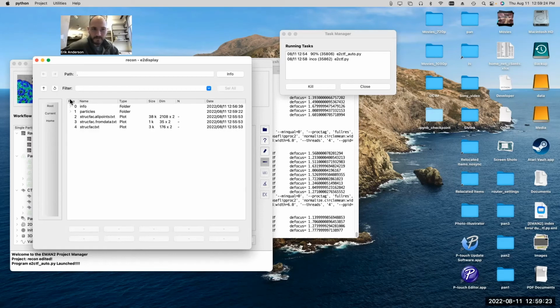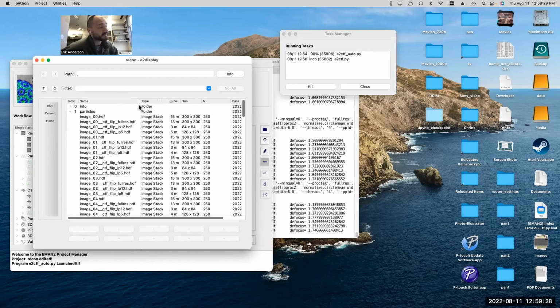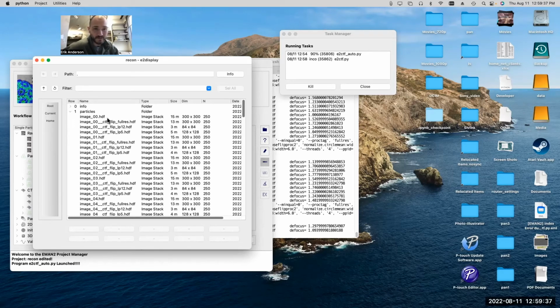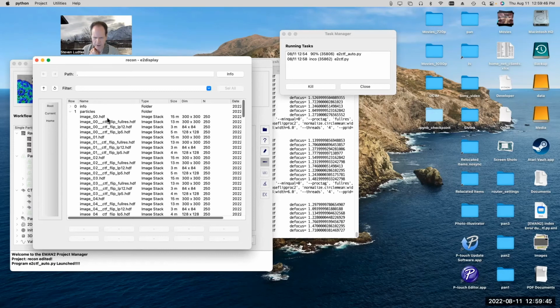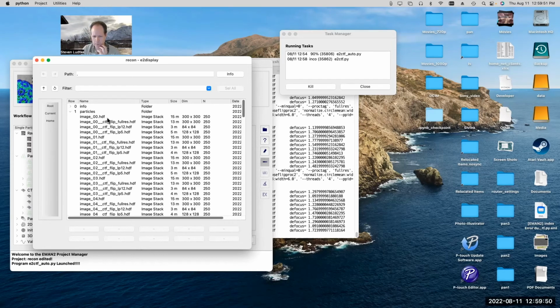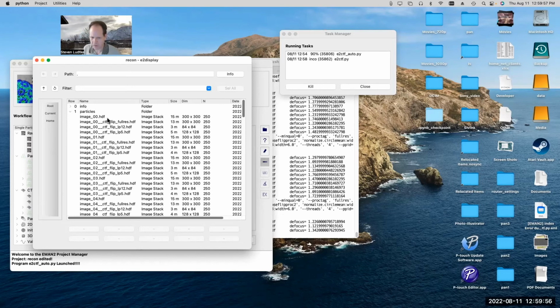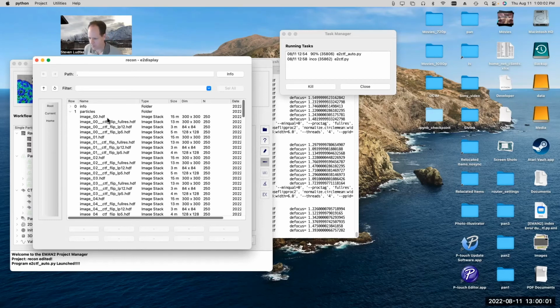Okay. And the current way EMAN2 calculates the CTF, I know you guys have a paper in like 2016 or 2014 talking about the algorithm. I don't think we've changed it. It is in a paper somewhere, but I don't think we've changed the CTF determination in a long time, really. We added whole micrograph defocus estimation at one point, just so people could get initial estimates and look at their data quality more easily.